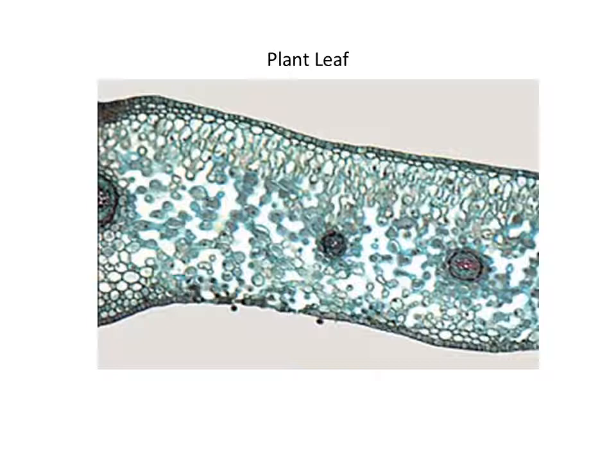based on its density. So the mesophyll, the palisade mesophyll, is this stuff on top. It's called palisade. It's defensive. You can think of it that way. But principally its purpose is trapping light inside the cell, or inside the tissue, as the light comes in. Beneath that is the much less dense mesophyll called the sponge mesophyll.